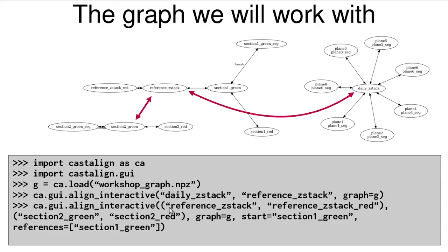So this is our first chunk. If you put these in brackets or parentheses, you can group multiple of these together, so then you can move them around and work with them as one chunk. So we have this section with the reference. We have the graph G in this context, and we're going to start with section 1.